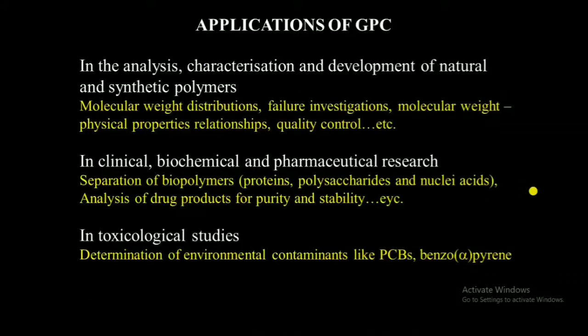If you look at the applications of gel permeation chromatography, as I mentioned, normally this technique is used in the separation or study of bigger molecules, especially polymers. So in the analysis, characterization and development of natural and synthetic polymers, the molecular weight distribution is very important. To know the molecular weight distribution, you can use gel permeation chromatography, or for any failure investigation, the reasons for failure of polymers.